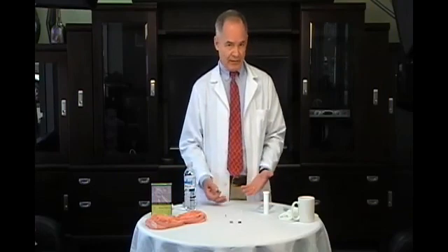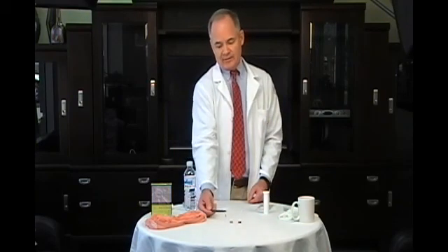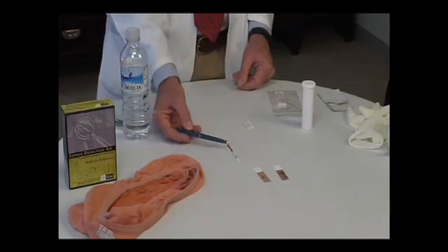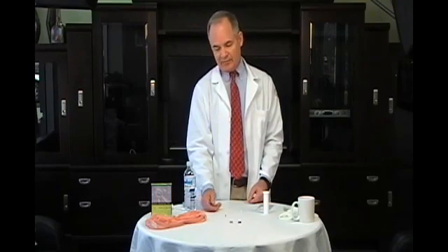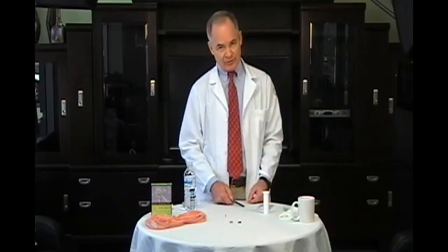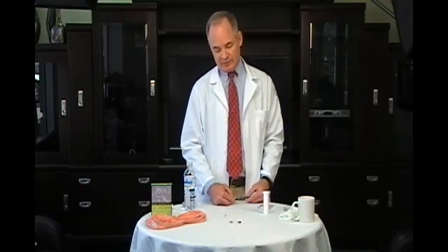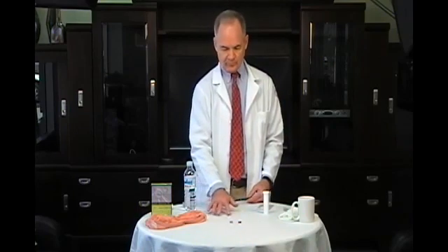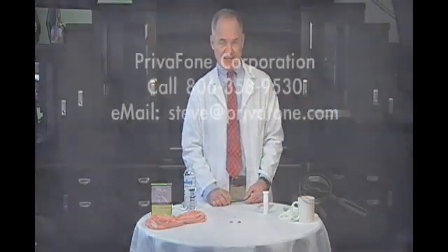So in the case of a weak test, you can have a more certain conclusion that the garment does in fact contain semen. The first test, AP, is a presumptive test. The second test, PSA, is a confirmatory test. Therefore, the semen detection kit that we have here is a two-step procedure of presumption and then confirmation that the material in the garment is in fact semen. This concludes our demonstration of the InSite Semen Detection Kit.